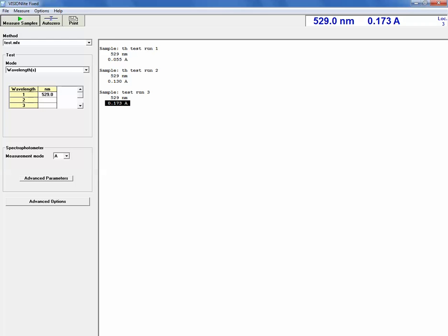All right, so if I want it to print this data off, the same thing happens here, right? I go up to the top and I hit print, and it automatically triggers it to the right printer, and now my data is ready for me to be picked up.